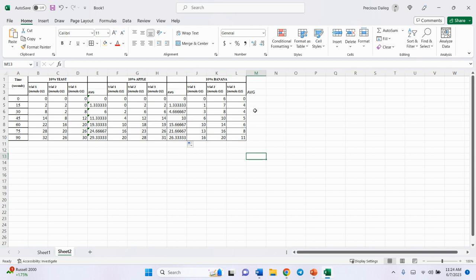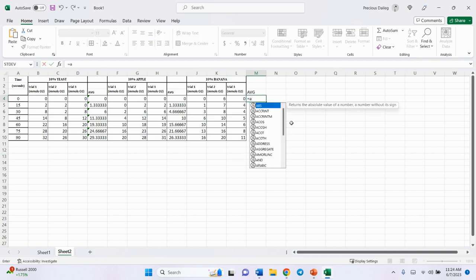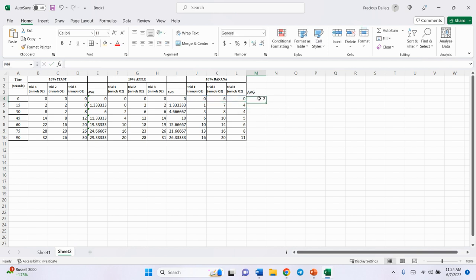And then those are the numbers. And then one more time over here, type out the word average, highlight my trials, close parentheses, and then drag it down. All right, so those are the averages of my trials. I'm just going to highlight it so that you guys know what we're dealing with. These guys right here.